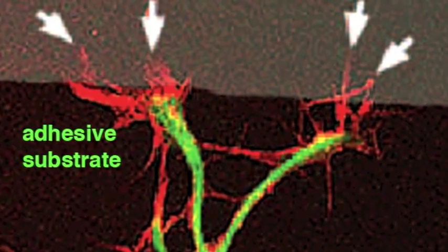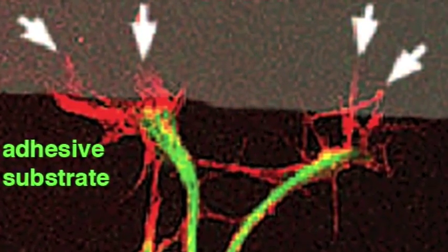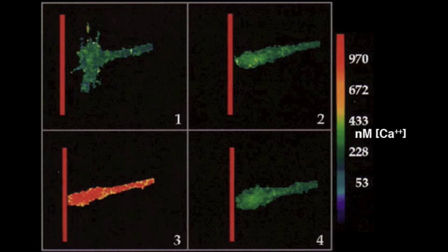Filopodia, shown in red, sample the CSPG surface, but microtubules in green never cross the border because adhesions are not made. In addition, CSPG induces growth cone calcium spikes seen in panel 3 that stop growth cone advance.